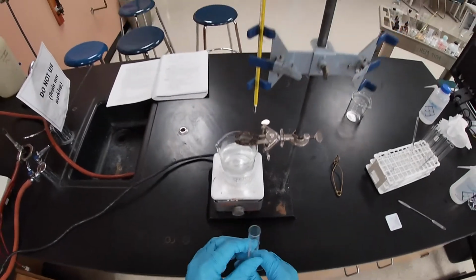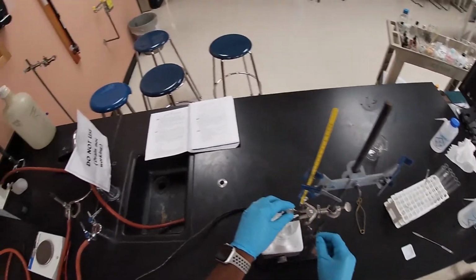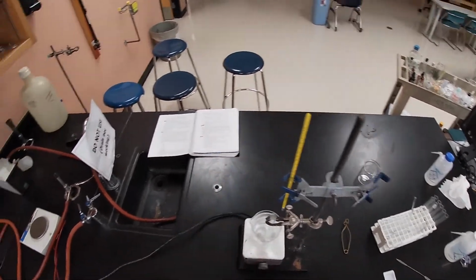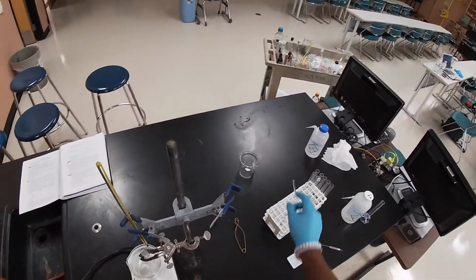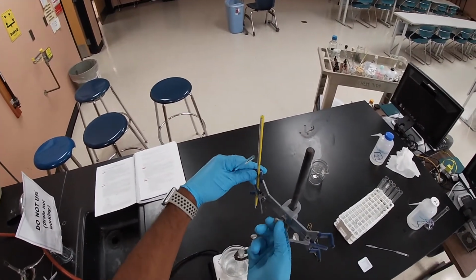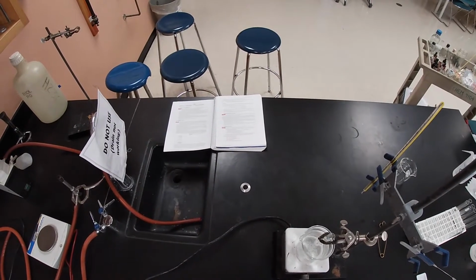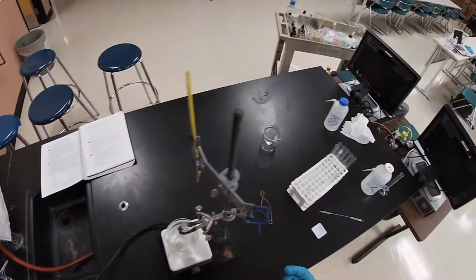So now what I'm gonna do is place my test tube into the water bath. I'm gonna go ahead and submerge it and tighten it, okay? And then I'm gonna place my thermometer inside there, and I'm gonna get a stirring rod that I have here, and mix the solution a little bit. I'm gonna turn this to the side so I don't break it. And then I'm gonna stir the test tube as it's heating, and I'm gonna continue stirring until it dissolves.